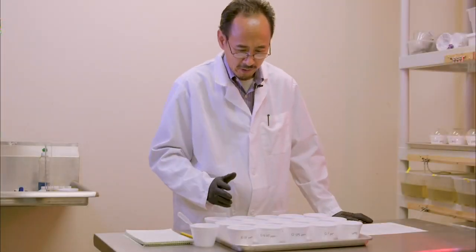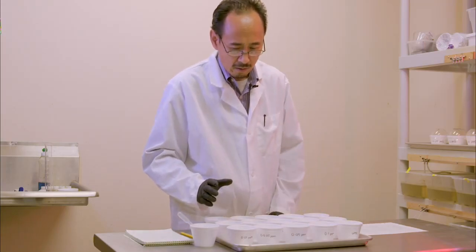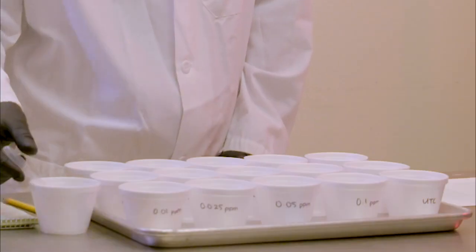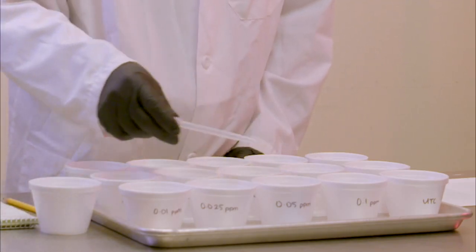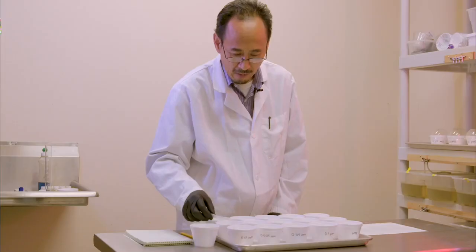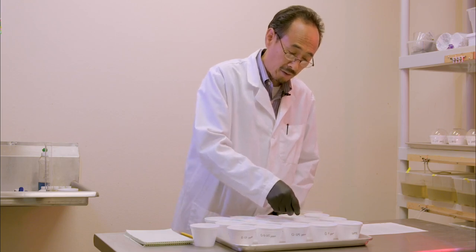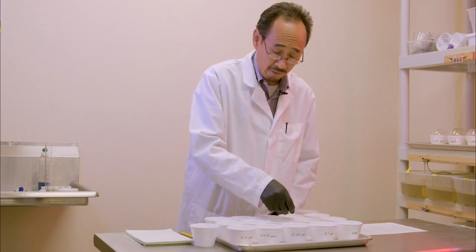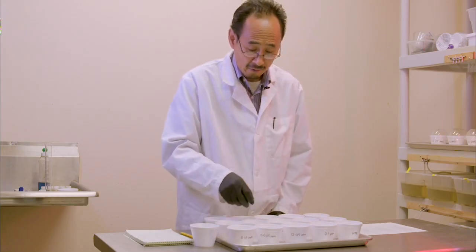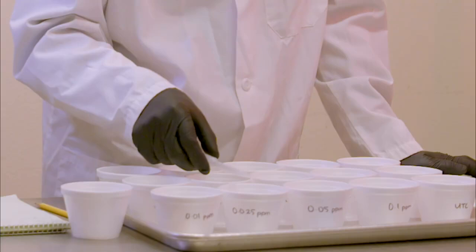So if you remember, earlier we talked about how to set up the assay. Now it is time, 24 hours later, you take a look, and you should see the range you're looking for. For example, from low to high, at the lowest concentration you should see very minimal mortality. Then you have more mortality, even more. And at the last concentration, ideally, you should see very few survivors. That means you get a good range for your assay. But sometimes it can be tricky to get this exact range. For example, your first one has no one dead and it starts from the second one.